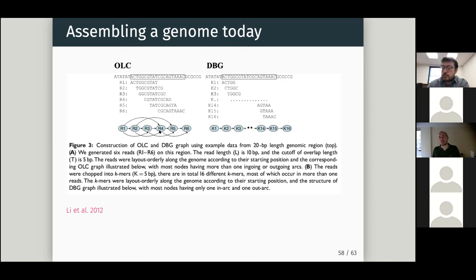And of course, here you can have a ton of different algorithms and sophistication trying to decide which should be the optimal overlap length. And this is what basically the assemblers are for. There are people working on this their whole lives, basically, to decide this kind of thing. But this is the core principle. So now that I have linked my reads, and of course we can do the same for the other reads, read 2 connects to read 3, and also to read 4 and read 5, and so forth. And now we have this graph.